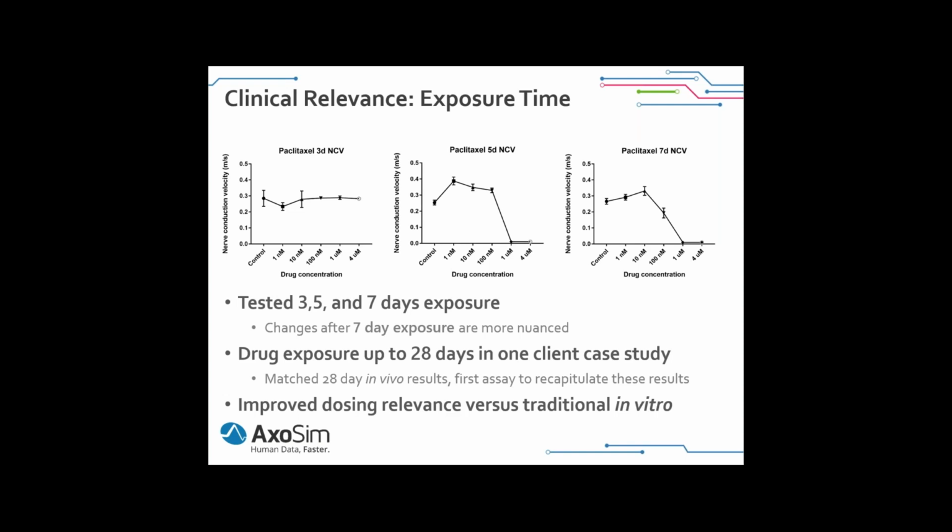So since then, we typically now do about 2 weeks of dosing, but we have in one situation taken dosing up to 4 weeks. So that's the 8-week total culturing. And we did this in collaboration with one of our pharma partners.